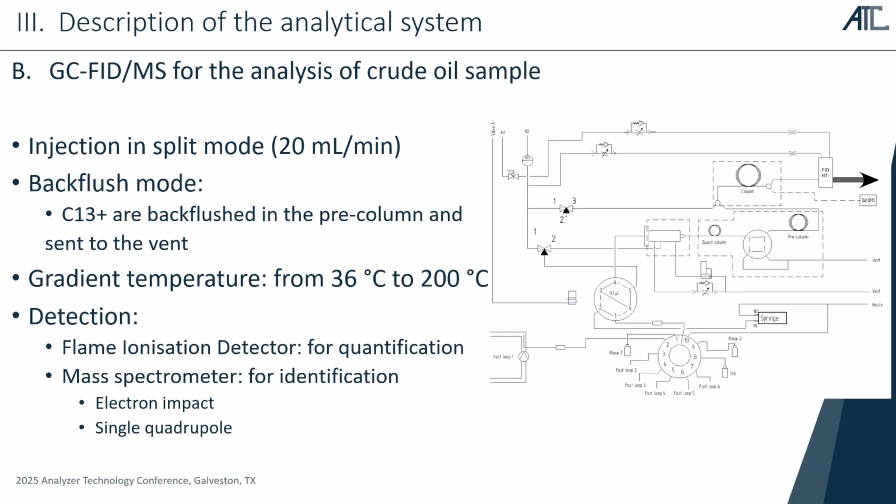So then here we go to the GC-MS. We inject into a heated injector with a split to vaporize the crude oil. The 0.1 microliter of crude oil is injected automatically and directly into the GC-MS. In this case, we focused on the light hydrocarbons.